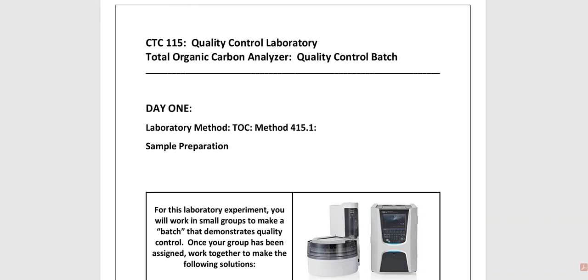On the second day, we're going to go in, we're going to show you how to input the samples, and I'll show you some basics of the instrument, so that way you kind of know how to get this thing started up, how you can get this stuff to do what you need done, and we'll go through that motion. It's not the only time that we're going to be using a TOC, but it is your first introduction so far if you've taken 114 and/or 115 and 150. So no matter who you are, this is the first time that you're going to see this in action.